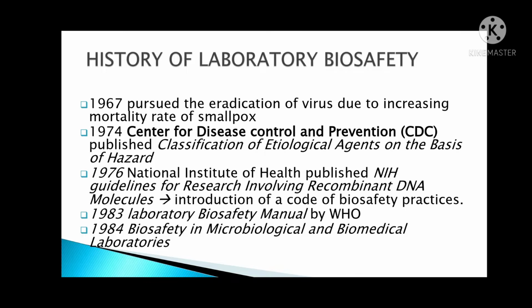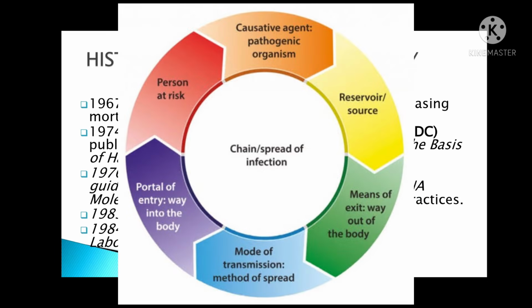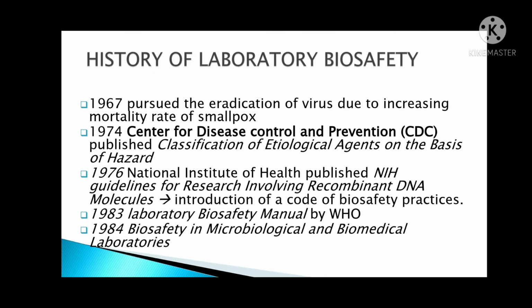I want also to emphasize in my lecture that in the year 1974, class, the Centers for Disease Control and Prevention published the classification of etiological agents on the basis of hazard that introduced the concept of establishing ascending levels of containment associated with risks in handling groups of infectious microorganisms that present similar characteristics.